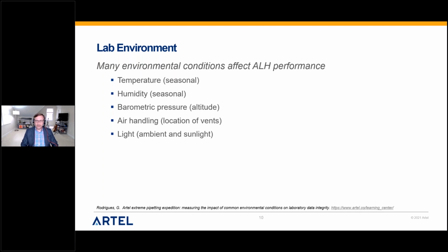It gets pretty brutally hot and humid during the summertime here, even though we have air conditioning in the buildings. That can actually affect the humidity and sometimes temperature inside the building. In fact, I remember many times in the laboratory where the facilities would overcompensate and it would be freezing during the summertime. So again, think about these kinds of considerations.